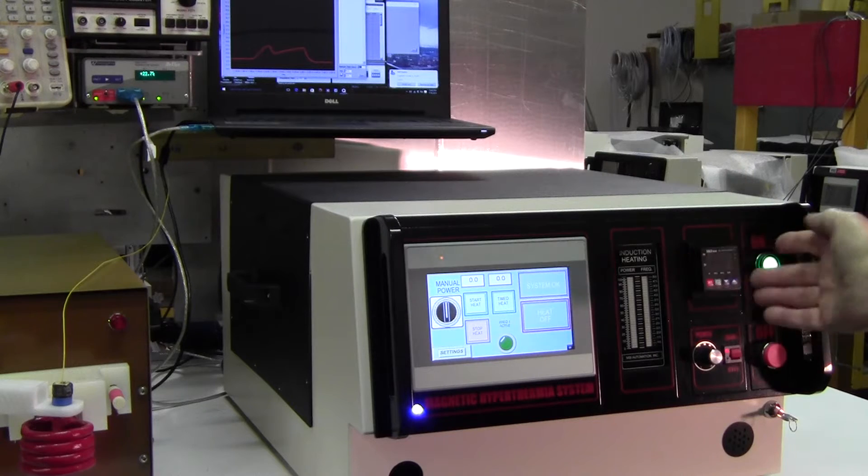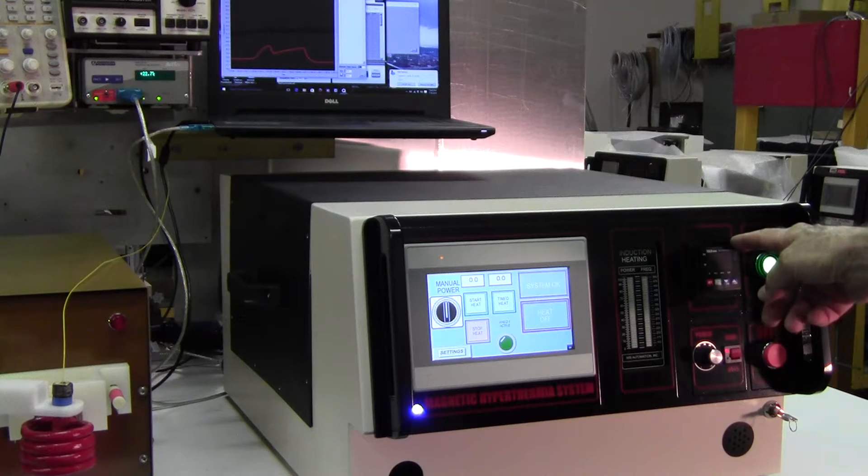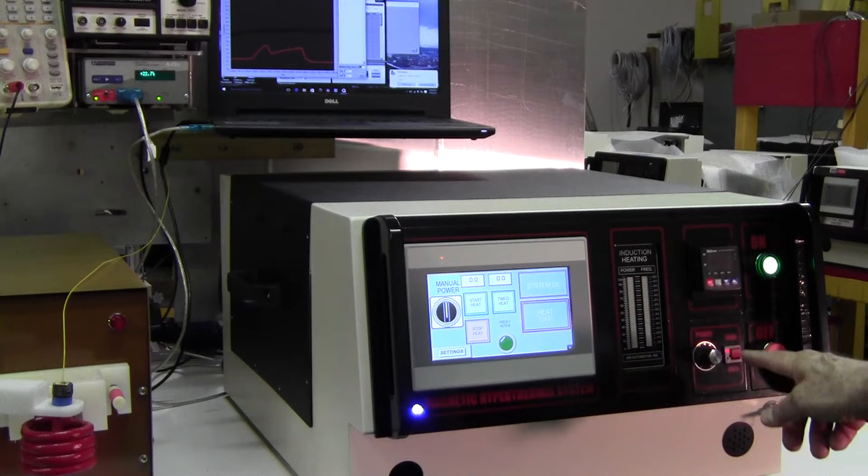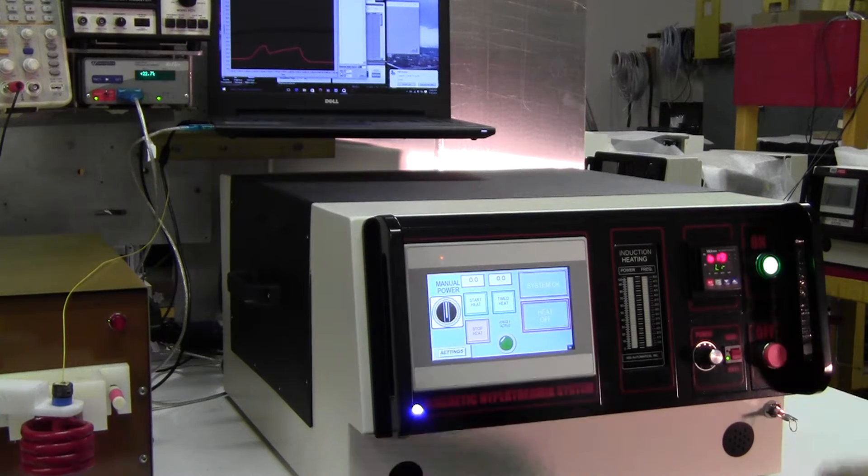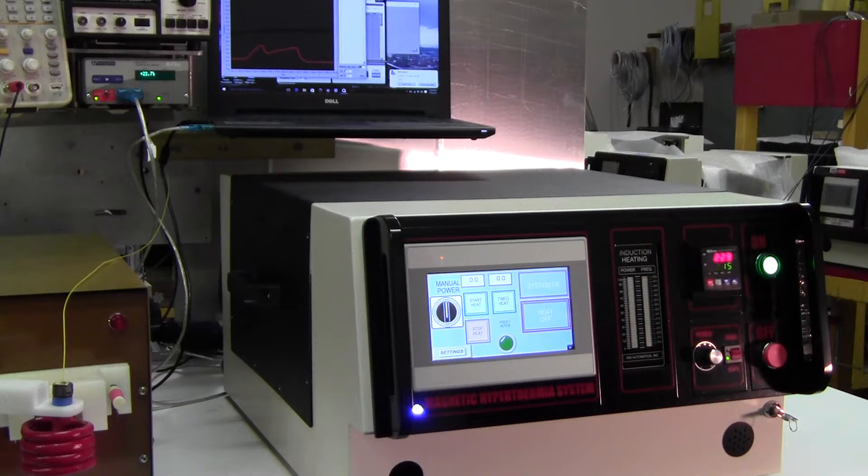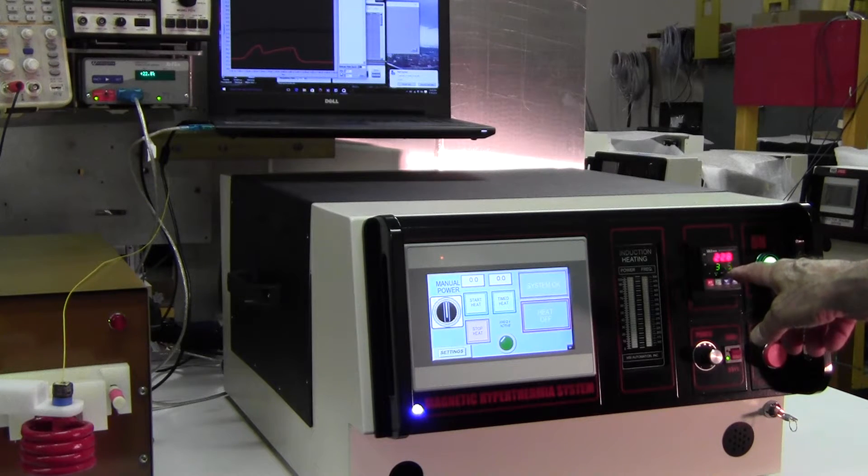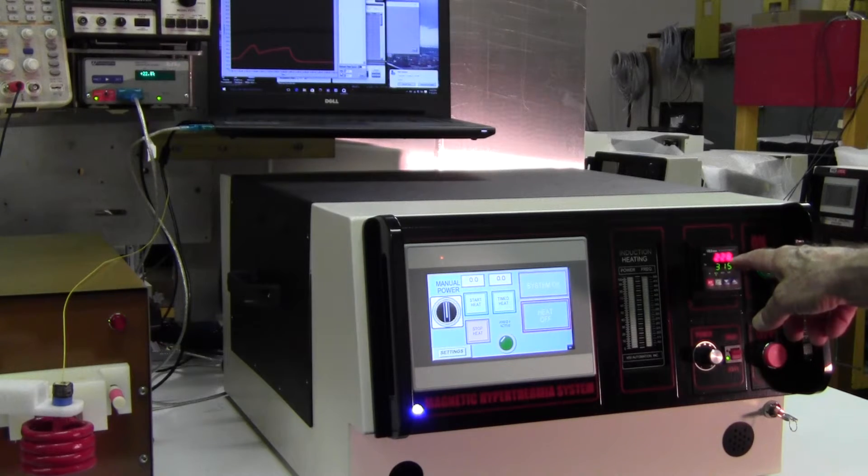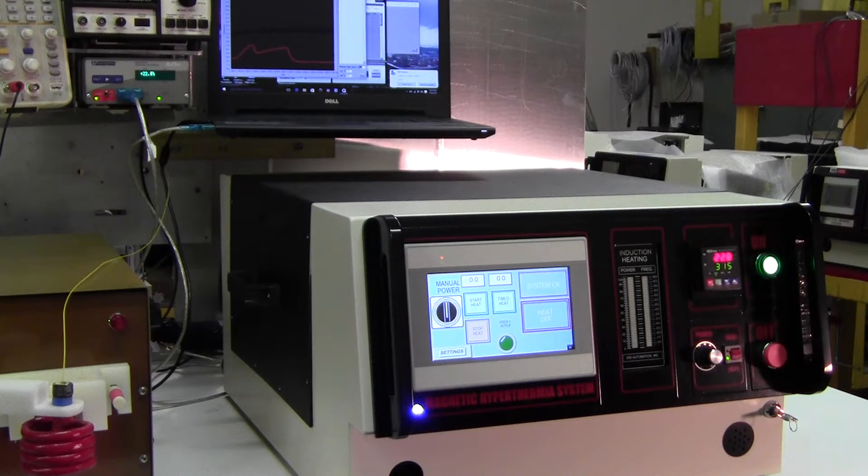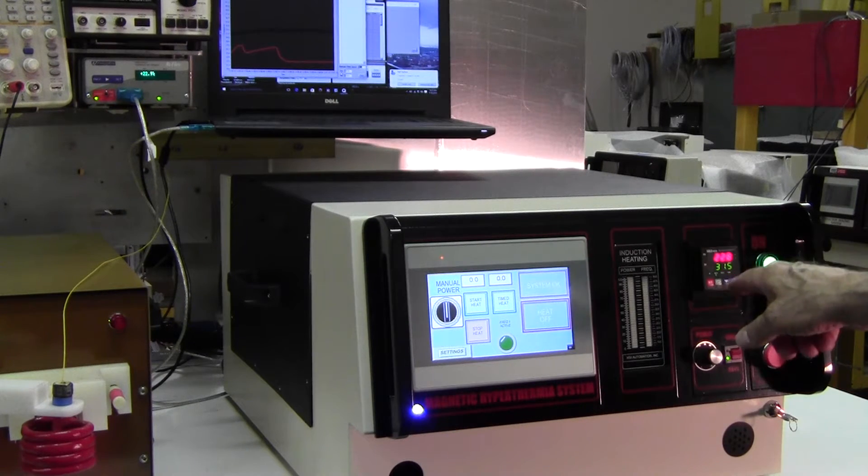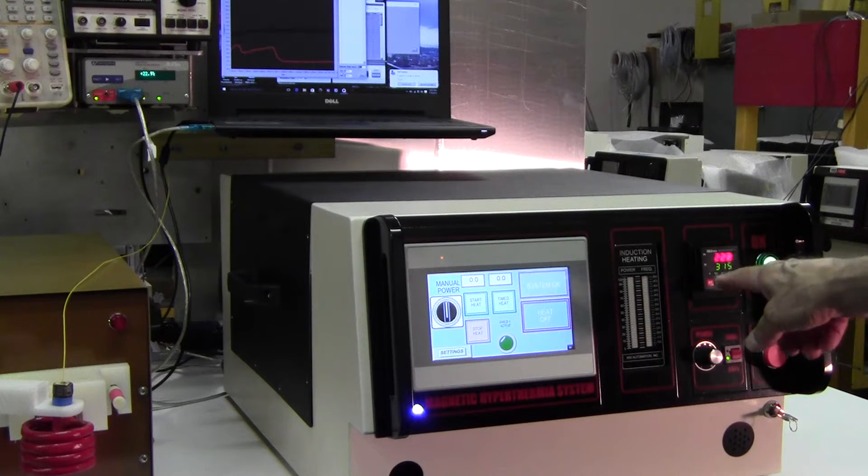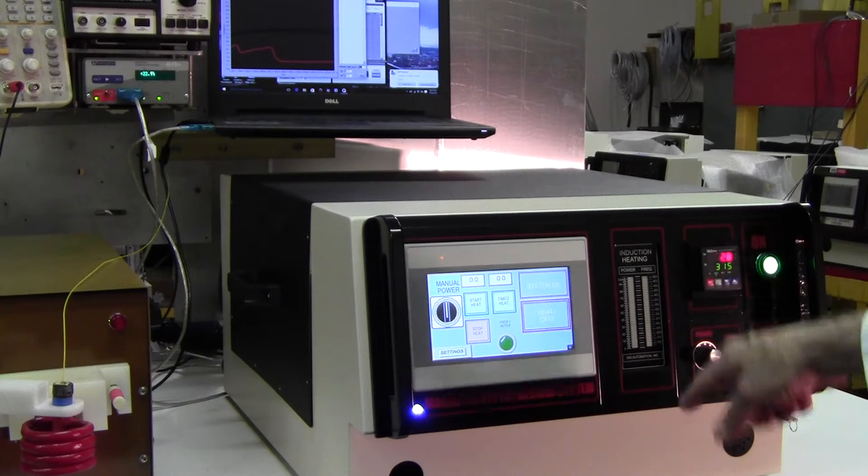The systems from MSI come with a sophisticated temperature controller. All you got to do is push that button. Right now I've got it set for 31.5 degrees centigrade, and we're measuring at 22.8. So what we want to do is we'll hit the foot switch and we'll keep the power on until the temperature reaches the set point, at which point the power will modulate automatically.